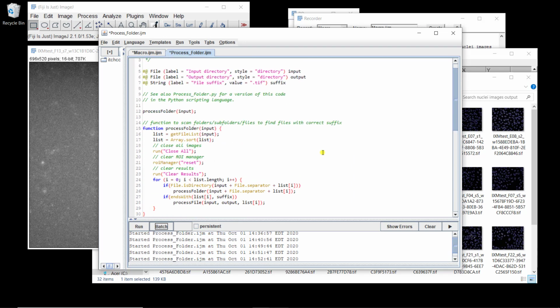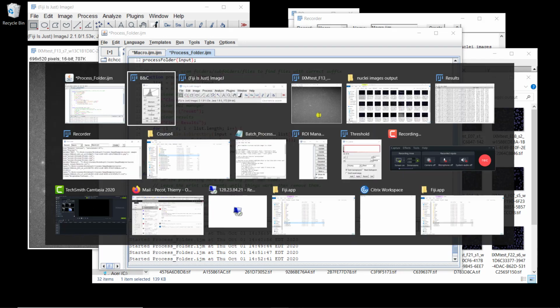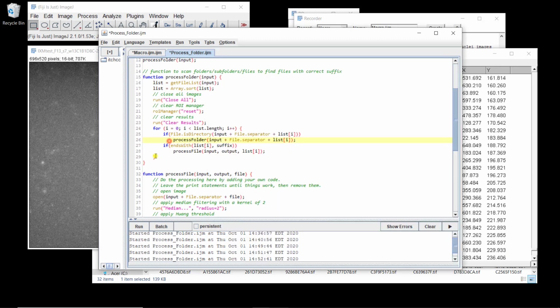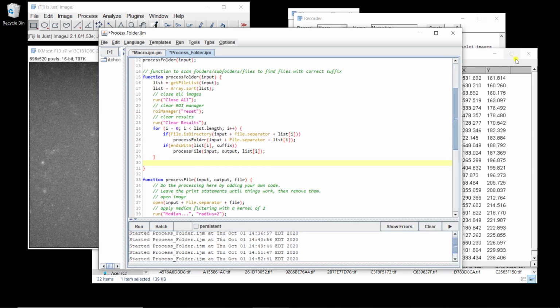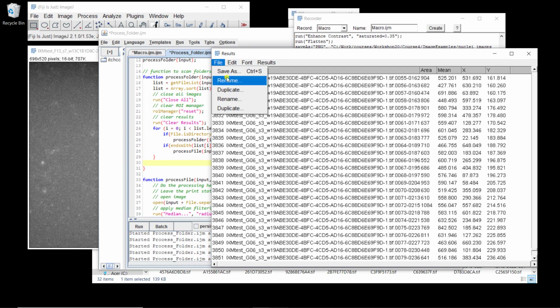So that's really, really powerful, and I know you're not experts in coding, but it doesn't require a lot of expertise, and it's really worth the time spending because it's going to allow you to do much more reproducible and much more powerful processing. One last thing maybe I didn't mention, so we get the results here. I saved it manually. You could actually save it here, so let's just, I don't know what it does, but I guess here that should be recorded in the macro.